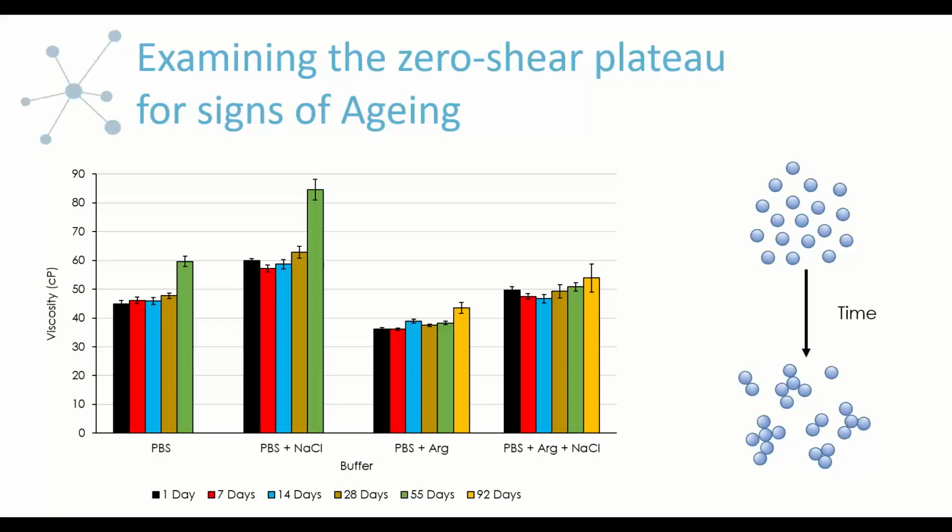We speculate that the reason why we saw this flocculation, this irreversible aggregation, early is that the high ionic strength sodium chloride solution dehydrated the surface of the protein itself, the salting out effect.